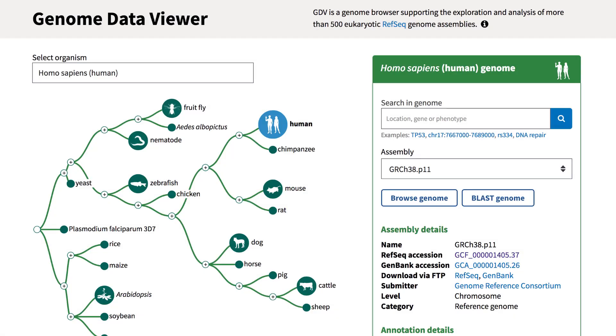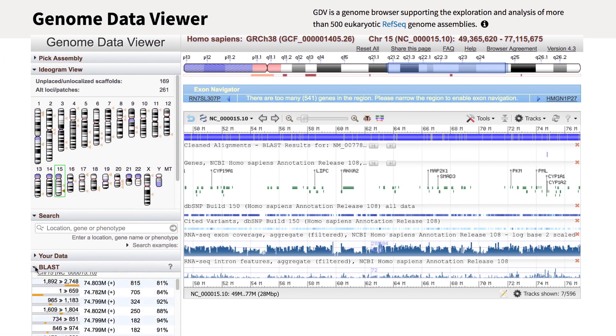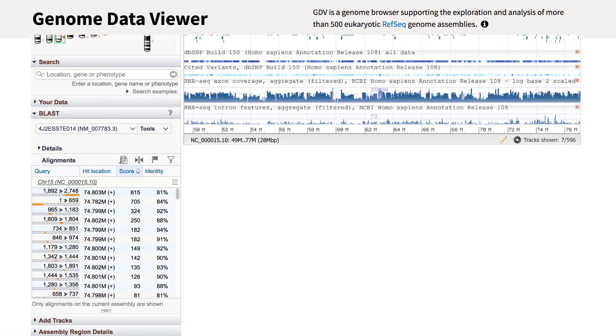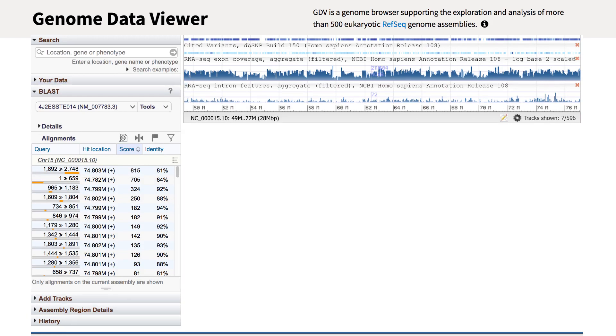We continue to add features to NCBI's genome browser, the Genome Data Viewer. A recent addition is the BLAST widget, which we'll explore in the next two minutes.